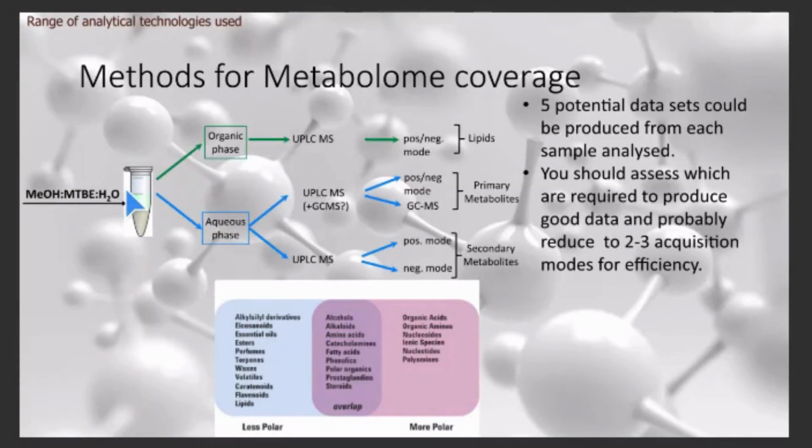What's more important, probably for the context of this presentation, is to understand how we can capture the metabolome at a fundamental level. So it's not a matter of simply grinding up a sample and washing it with a bit of methanol and chucking it into your instrument. The metabolome is incredibly rich, and all analytical techniques struggle to deconvolute that sort of rich information. So generally we would try and fractionate our one sample into several different fractions and run them in different ways on different platforms, which would target different types of metabolite pools.